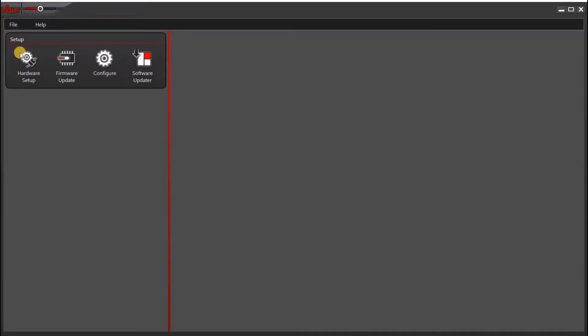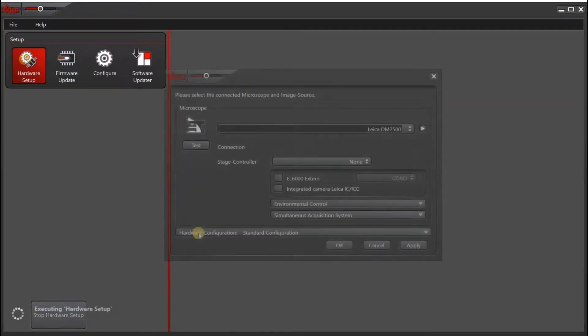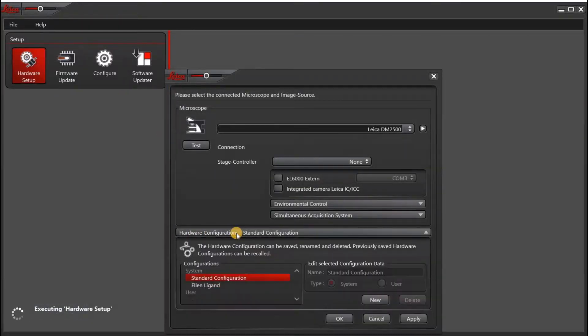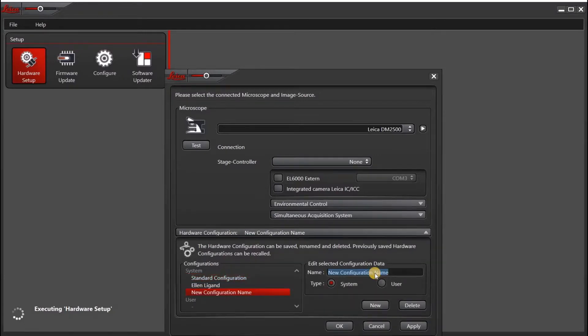Next, click on the hardware setup icon. Then under hardware configuration, click new. You'll want to enter a name for your configuration.